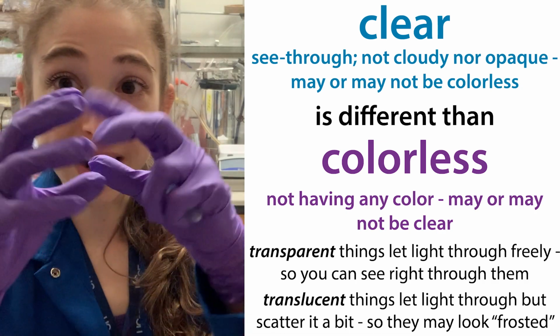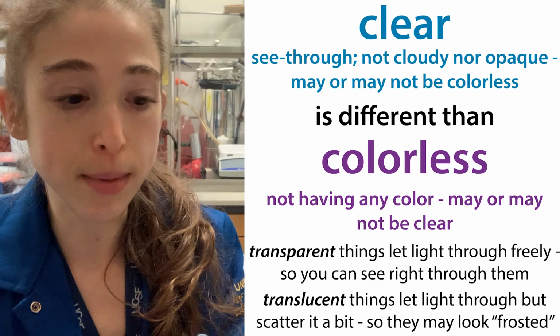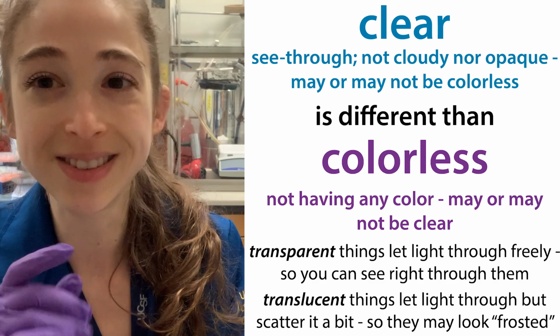And so you're still going to have all this cloudy, clumpy gunk in there. And so I was waiting. I'm like, why is this not turning colorless? It's still white. And I was like, oh, it's colorless, not clear.